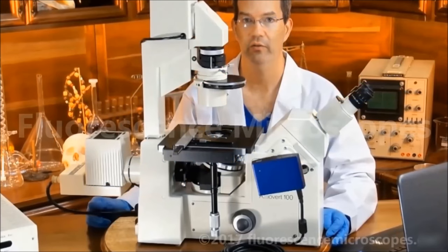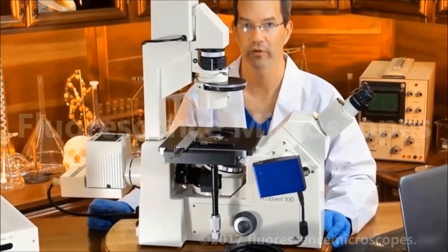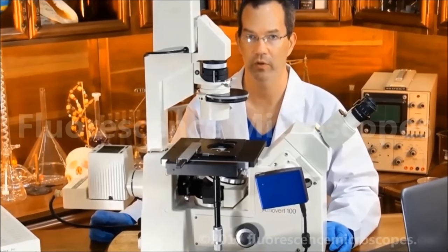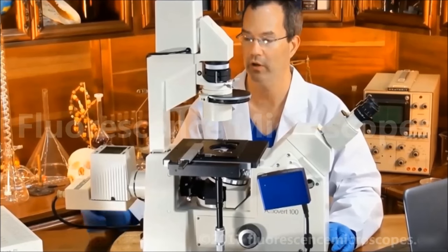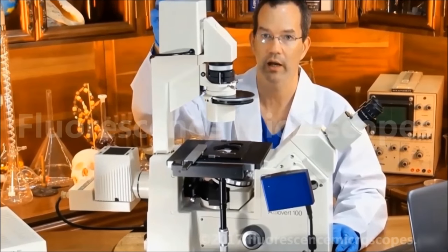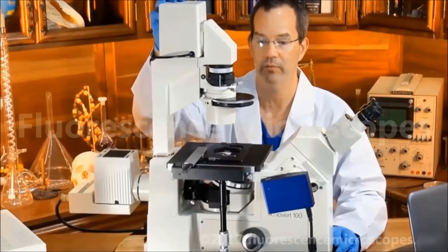This is a Zeiss Axiovert 100 Inverted Fluorescence Microscope. We've configured this microscope with a 100 watt mercury HBO illumination system and a 100 watt halogen transmitted illumination system.